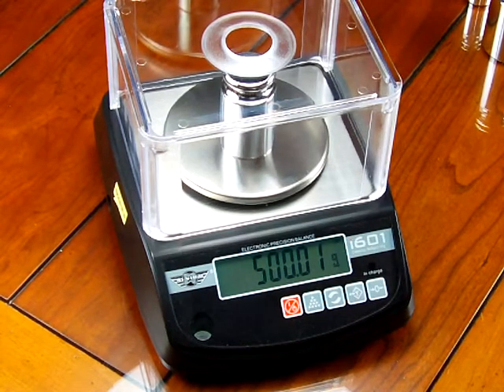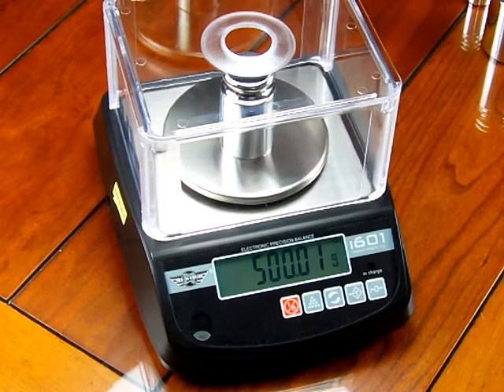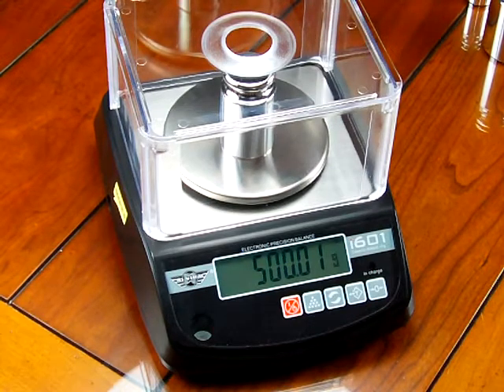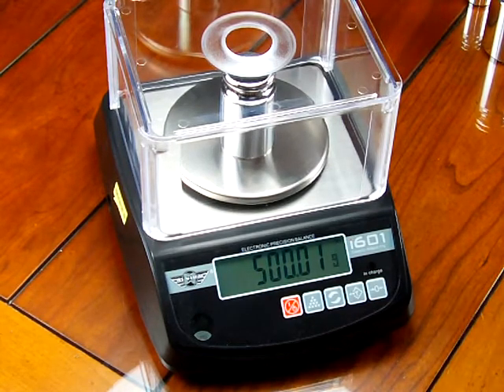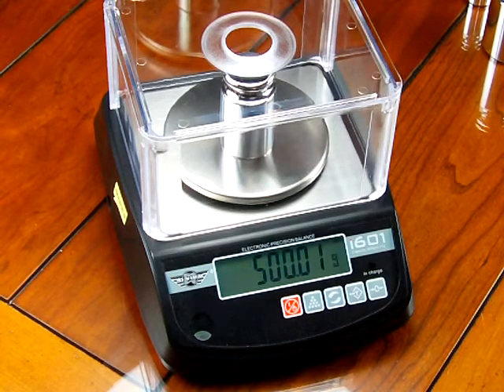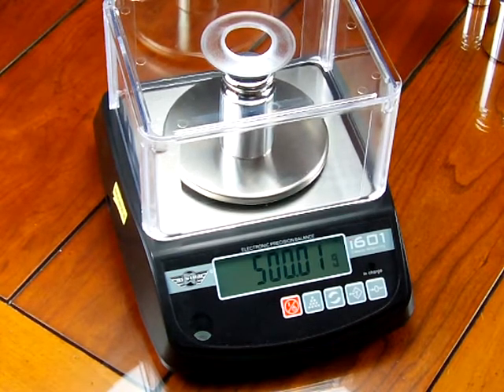MyWay offers spectacular value, but always consider the price that you're paying. You know, if you want a scale that goes to .01 gram, and you want a draft shield on it, a three-door glass draft shield, give us a call. We have other manufacturers, but I'll just tell you, the draft shield alone will be way more than the cost of this balance.